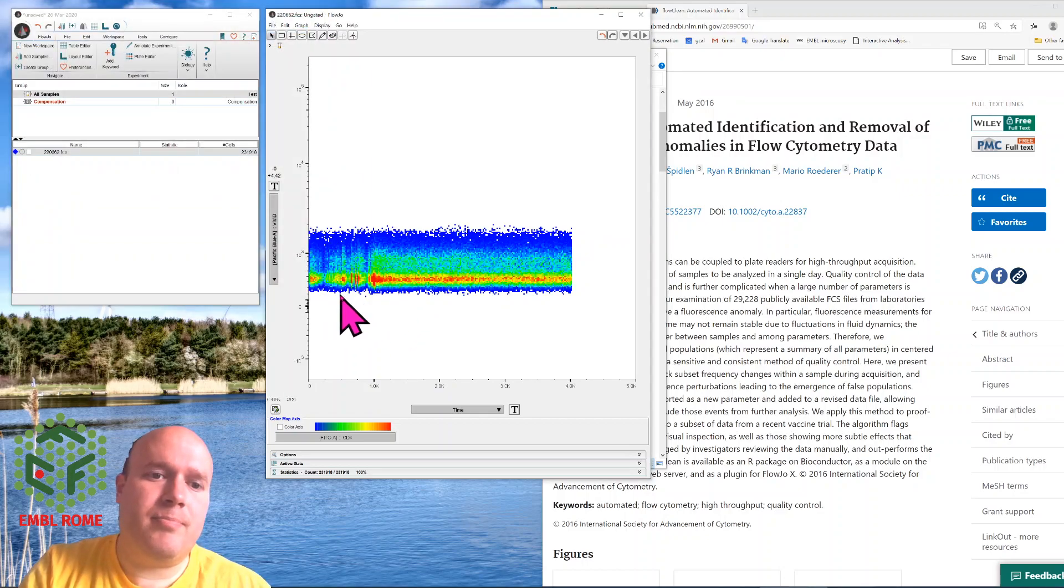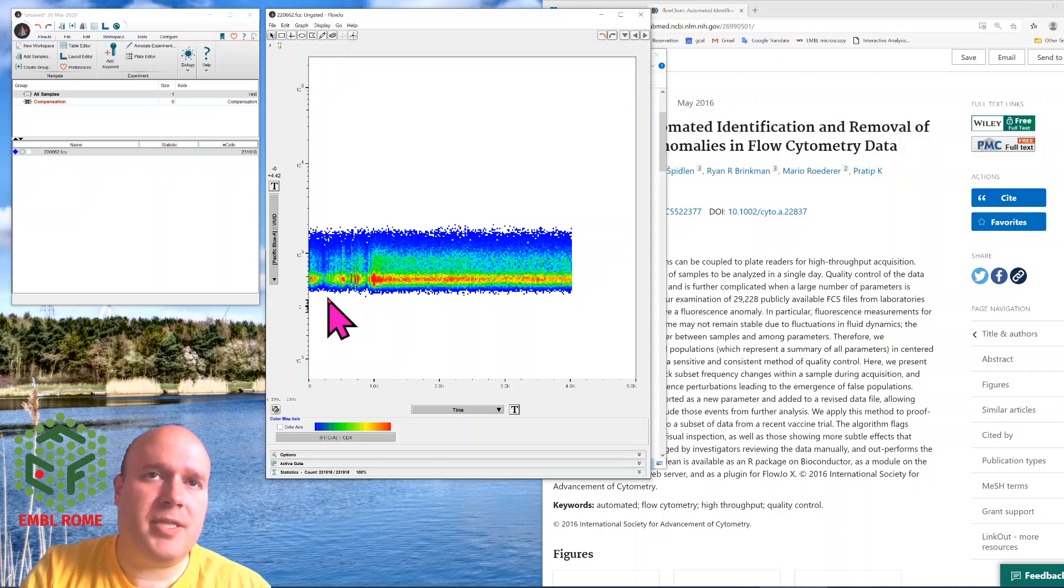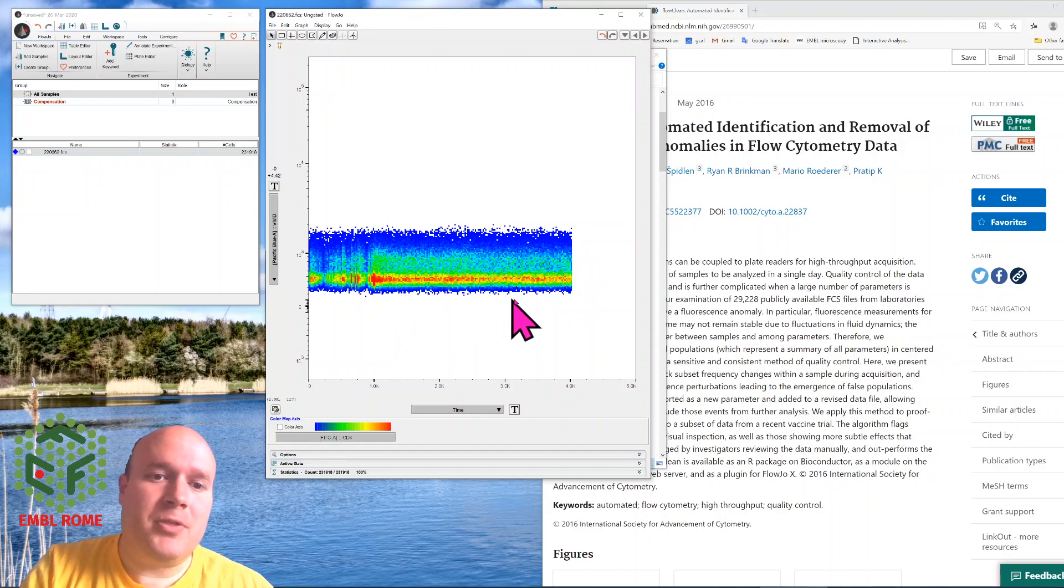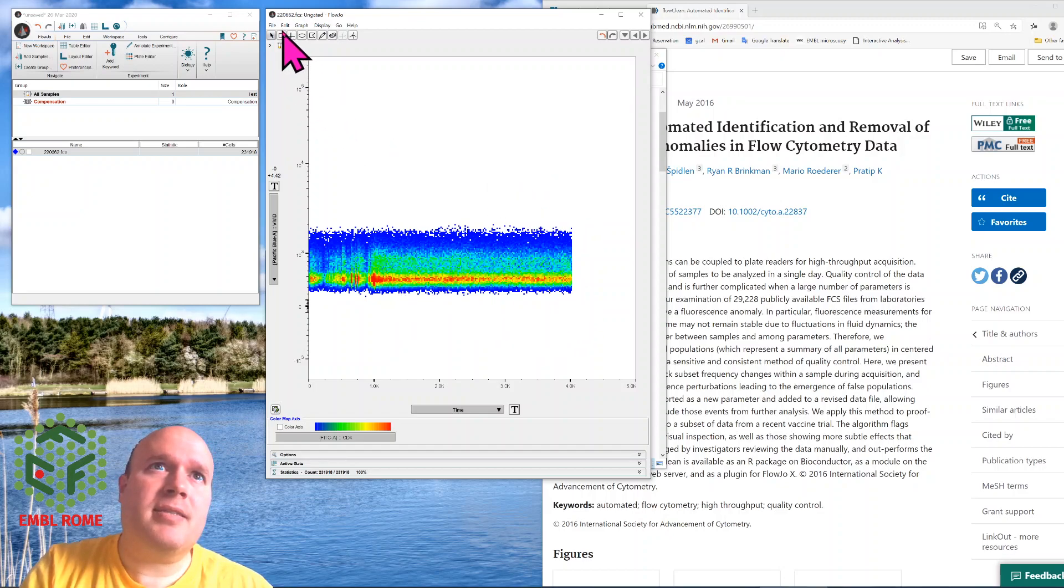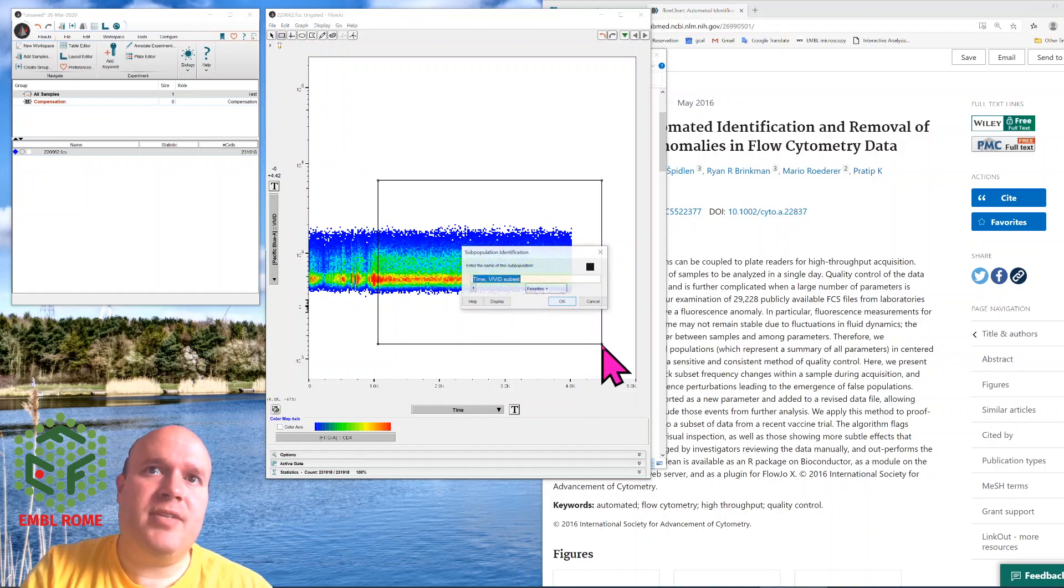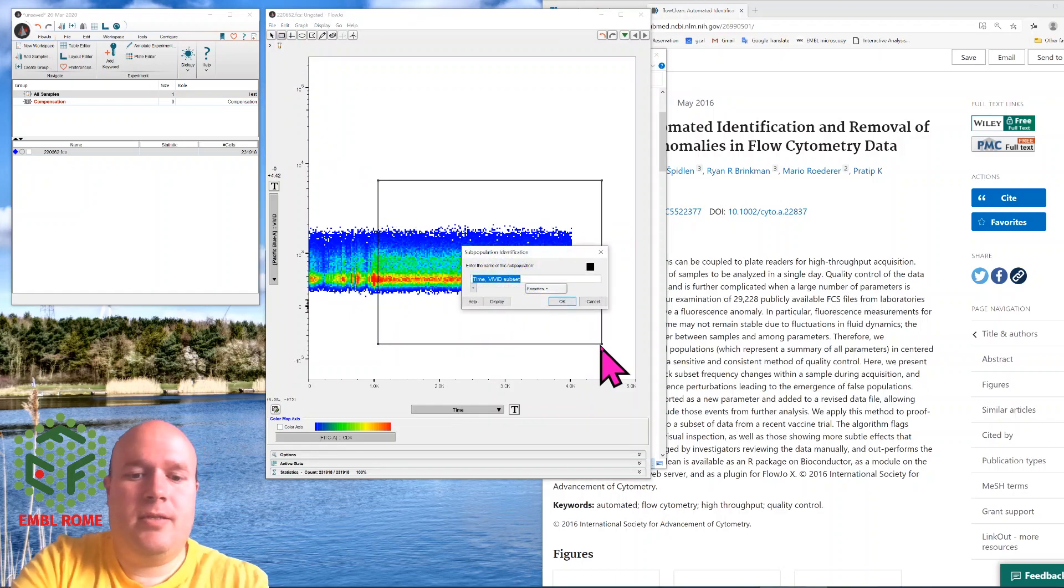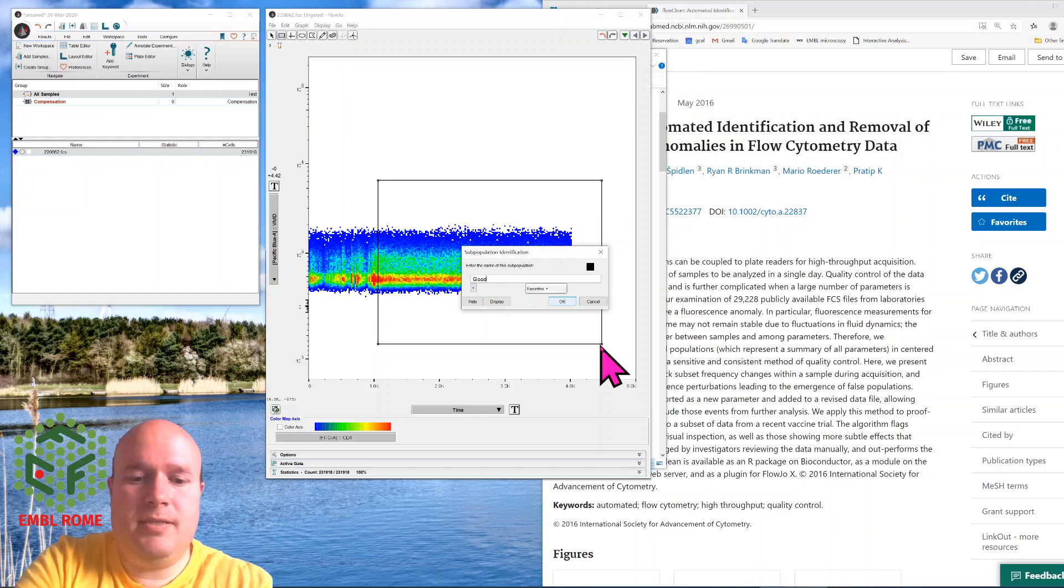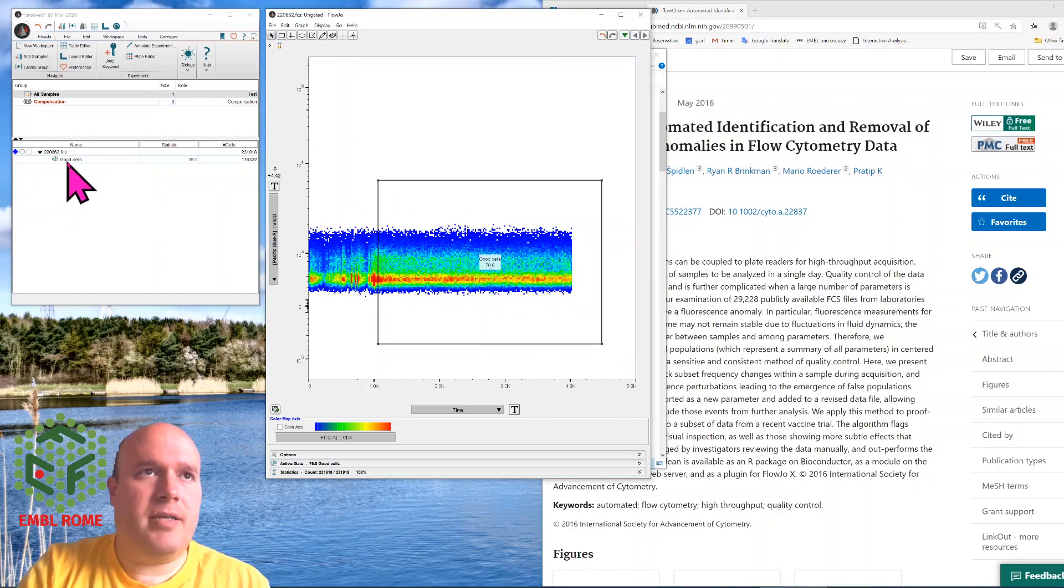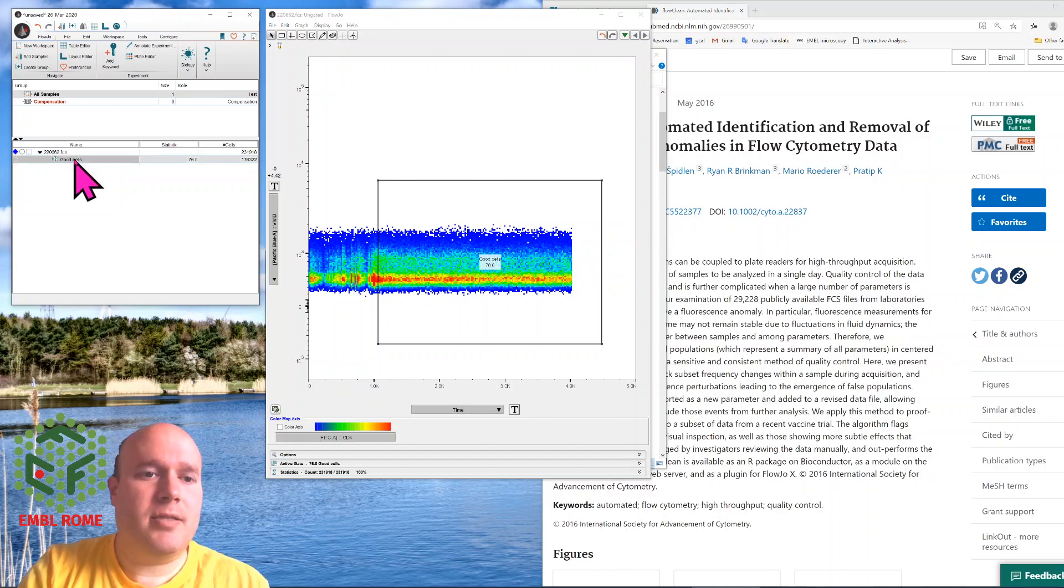We can see from here that actually near the beginning we have all sorts of issues. These are probably clumps of cells coming through the machine. What I want to do is just analyze this last section. I would get a rectangle gate, highlight all these events, call these good cells, and then from then on I would do my analysis on this good cell population.